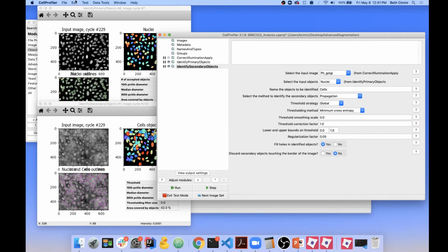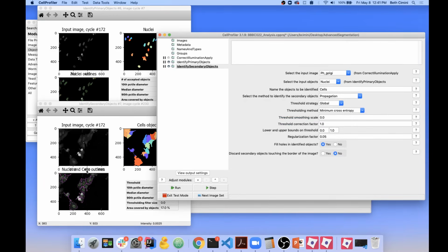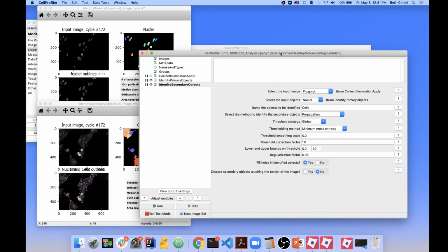And the big part of that is because it expects that the histogram is going to have a foreground and a background peak, and we don't really have any background present in those images. Here's a good example of one that I think is doing a pretty good job. This is picking a threshold of about 0.003. Our background is pretty consistently at 0.002. Now the problem here, like I said, is that there are no background pixels.